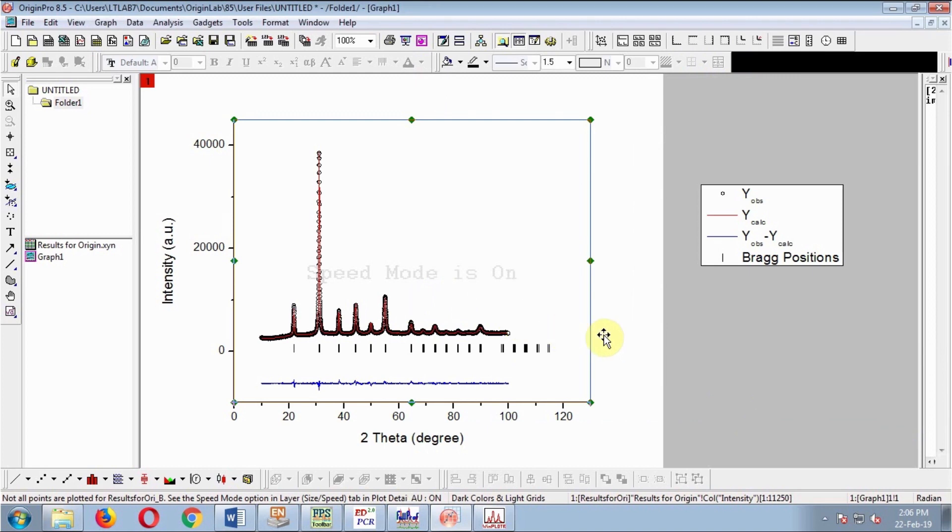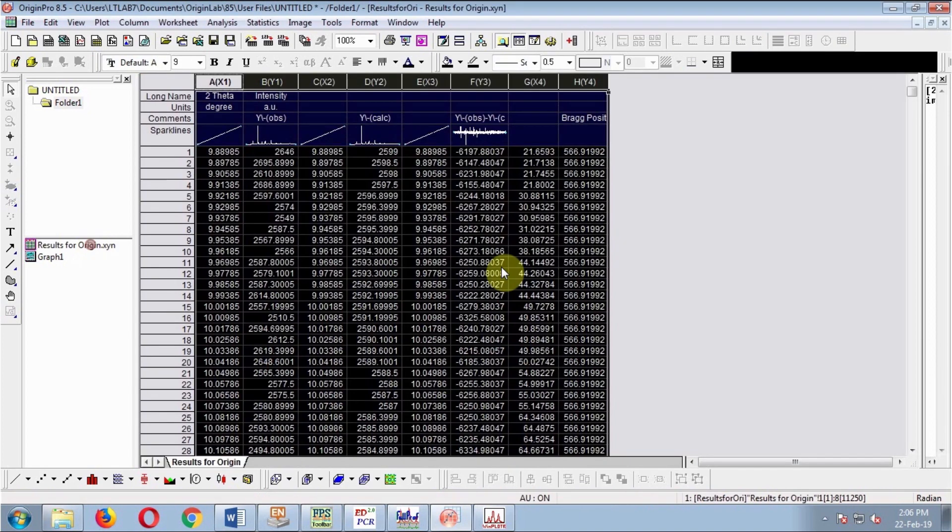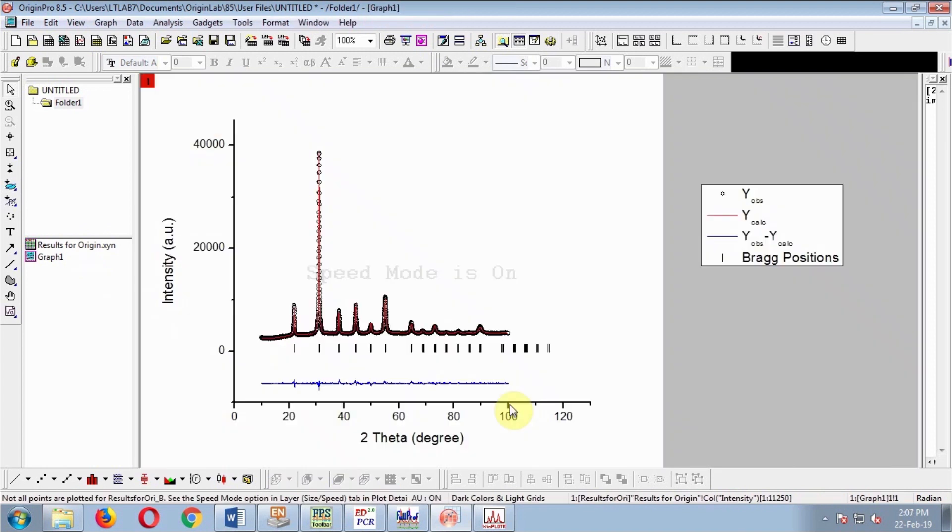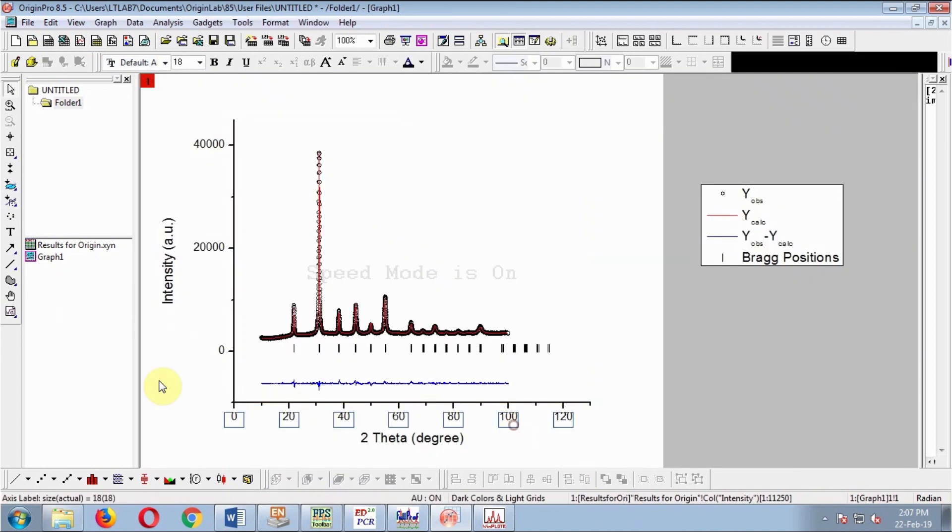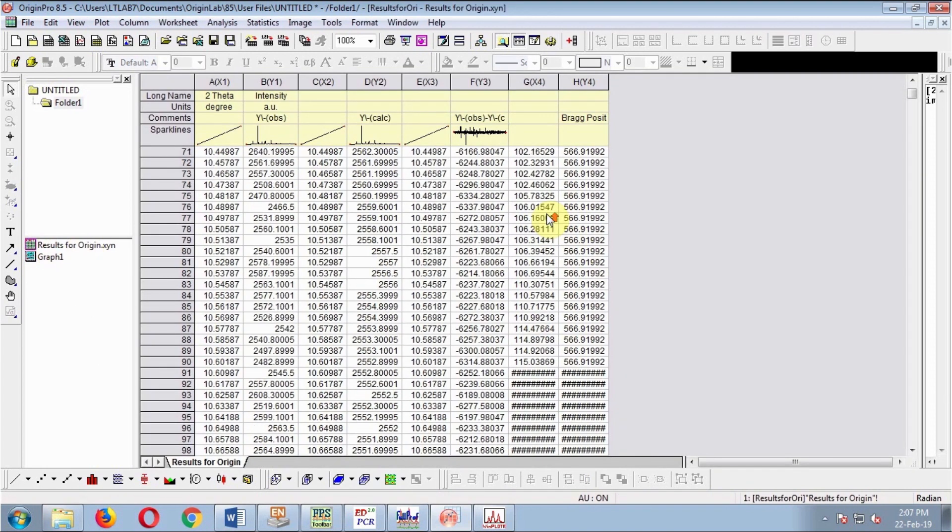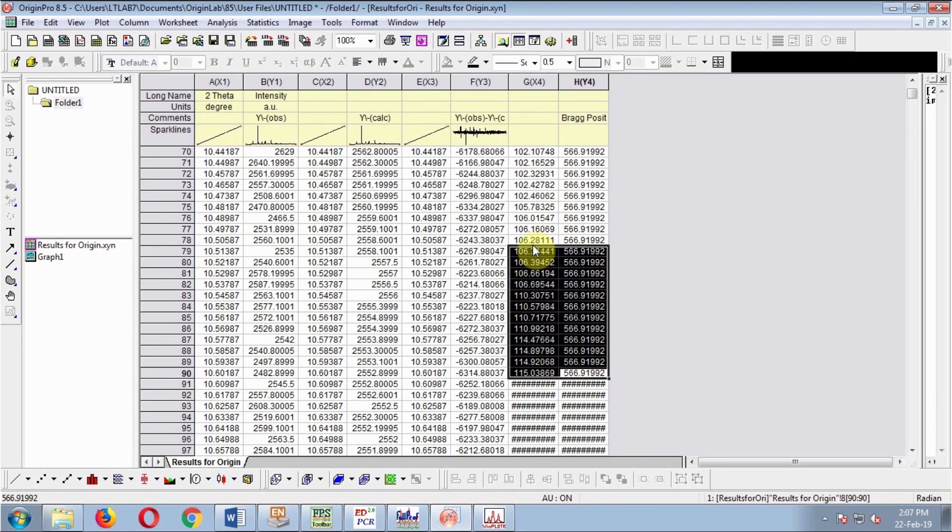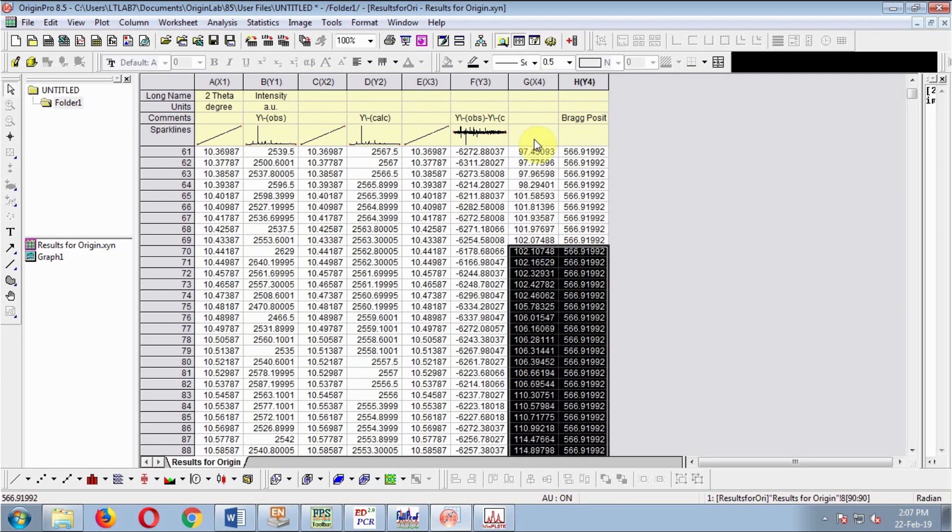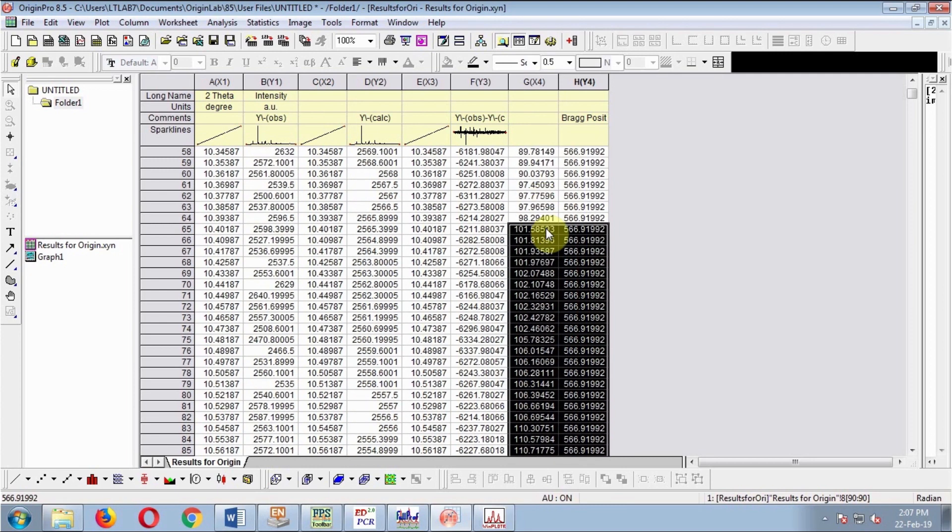I don't want these extra reflections that are out of the experimental range. Let's delete those.